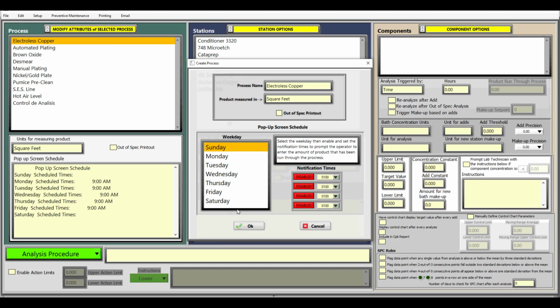This way it's efficient for calculating the events of your workweek schedule, where it's accurate what hours have elapsed between each analysis period, versus having the analysis scattered in gaps throughout the week.